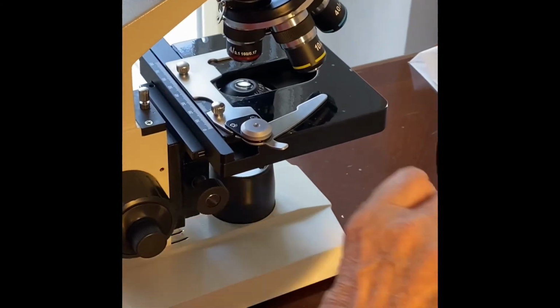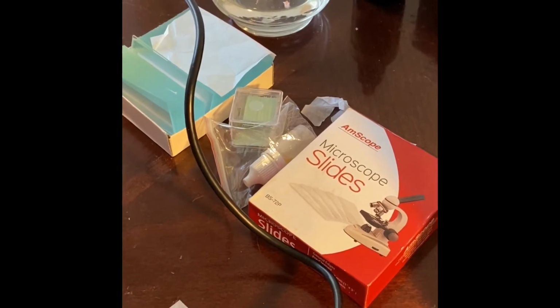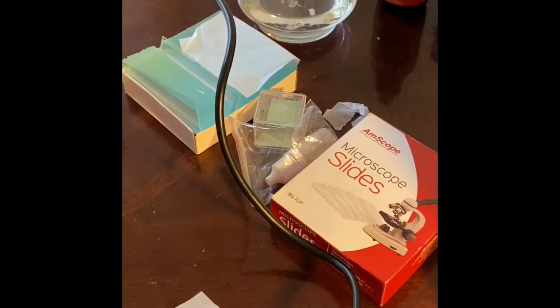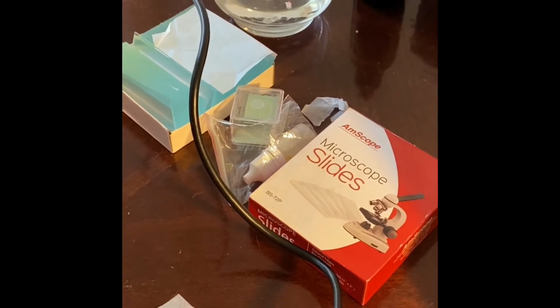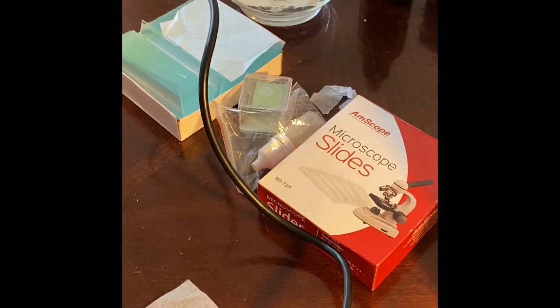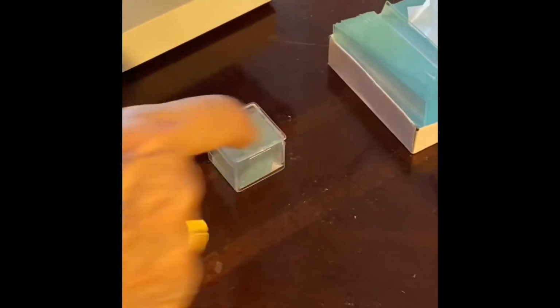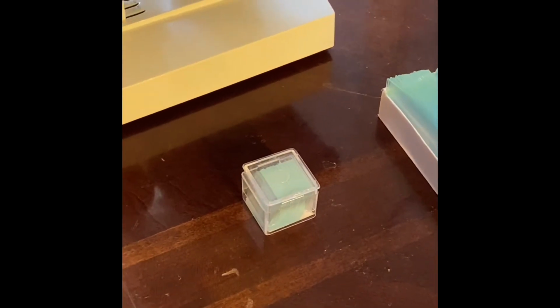The slides are ordered separately, or they may be purchased within the kit you buy, the microscope kit. Make sure you read carefully to see that there aren't any missing basic components like the microscope slides and the cover slips, which allow you to mount the specimen.